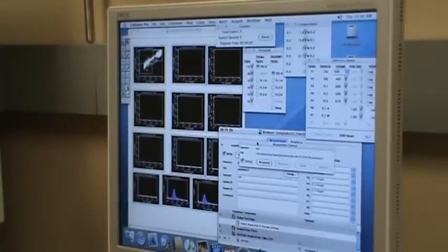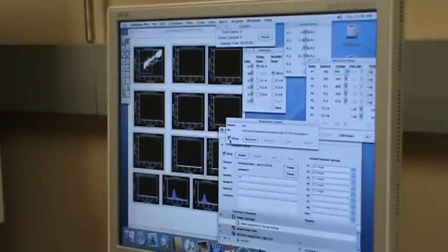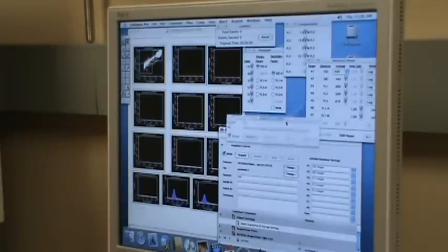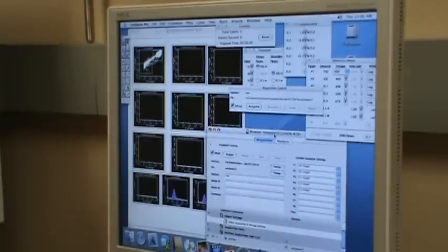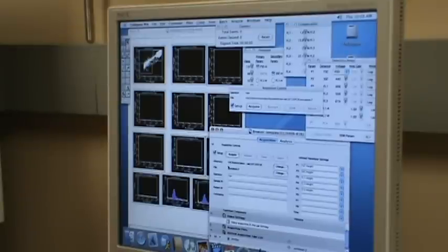Now, see at the acquisition control, there is the checks and setup. If the setup is checked, nothing is recorded. So if you want to record your experimental data, this setup has to be unchecked. In the main acquisition window, there's also a directory and a file. The directory is where you want to save your data, and the file is the file name for the current sample.